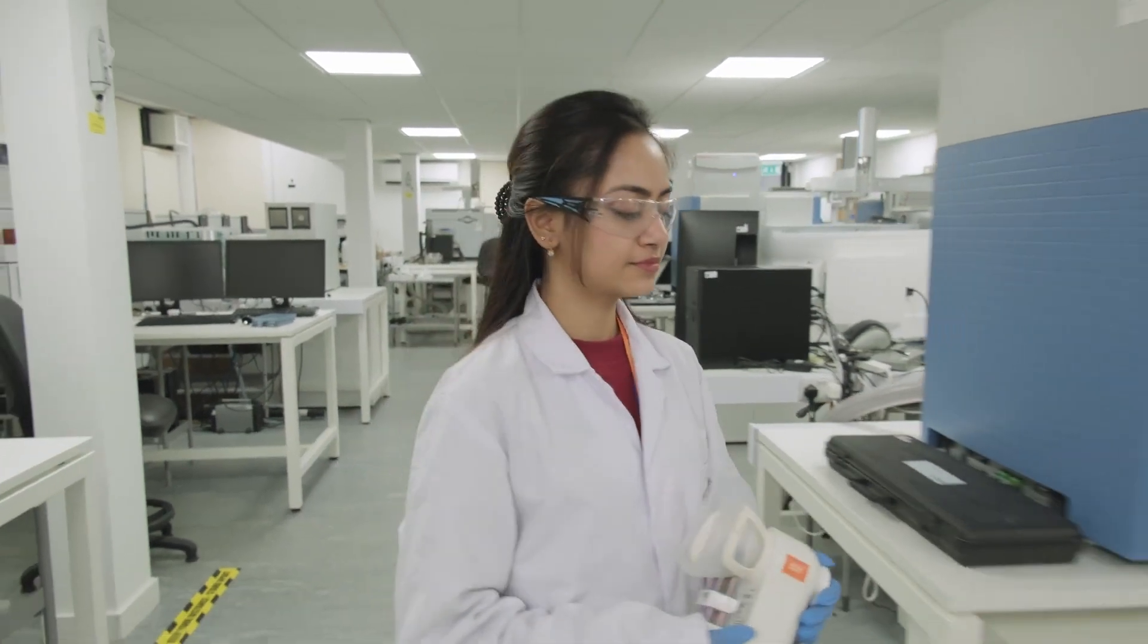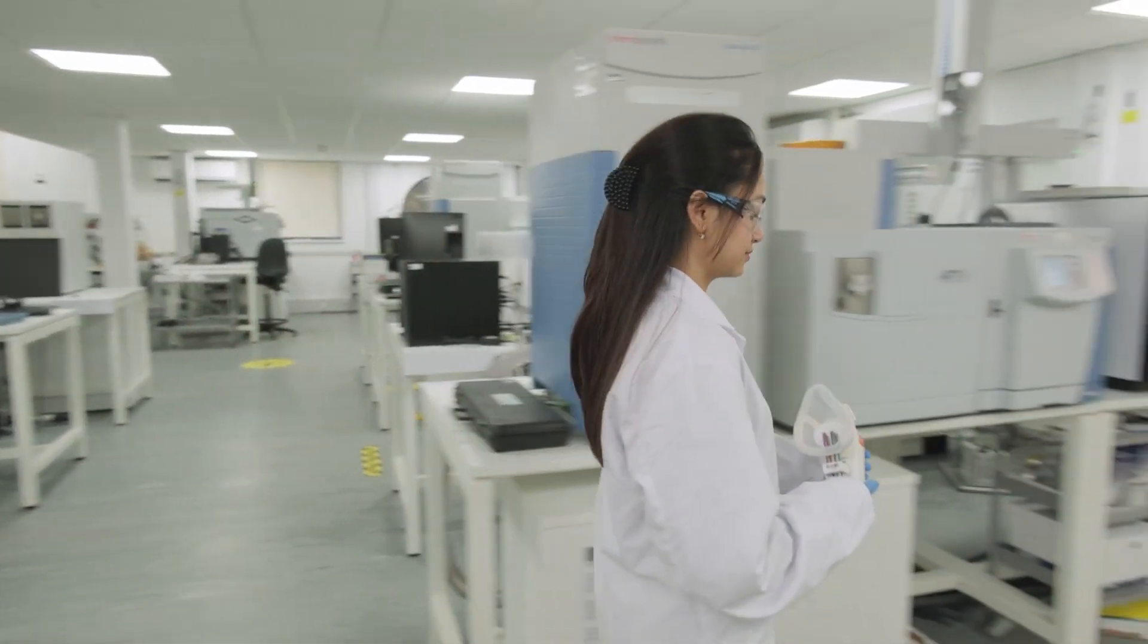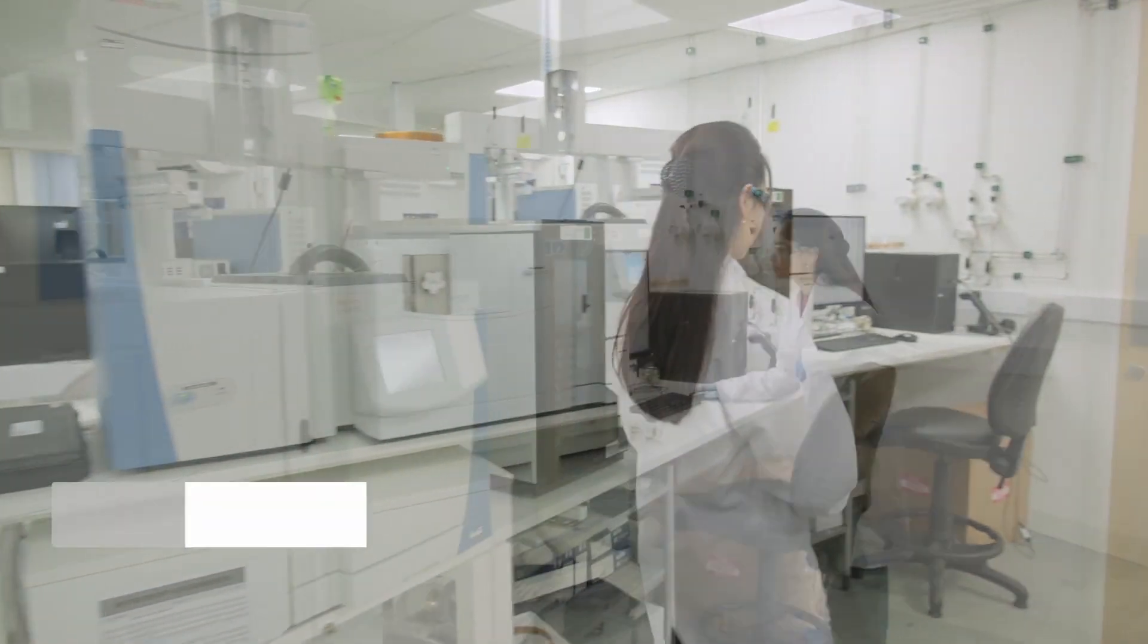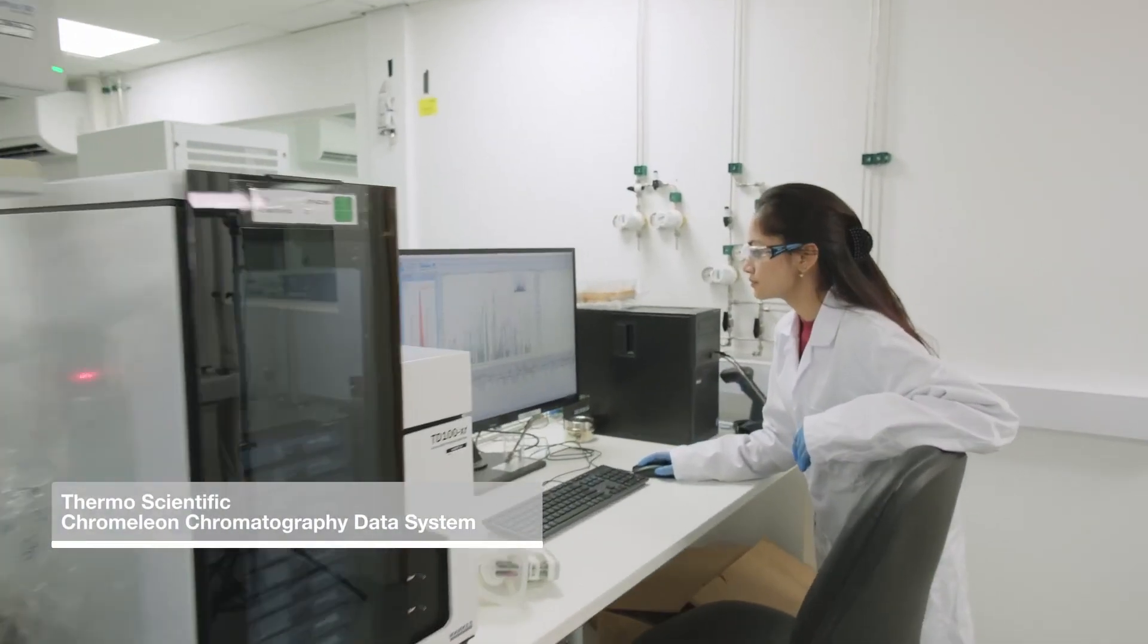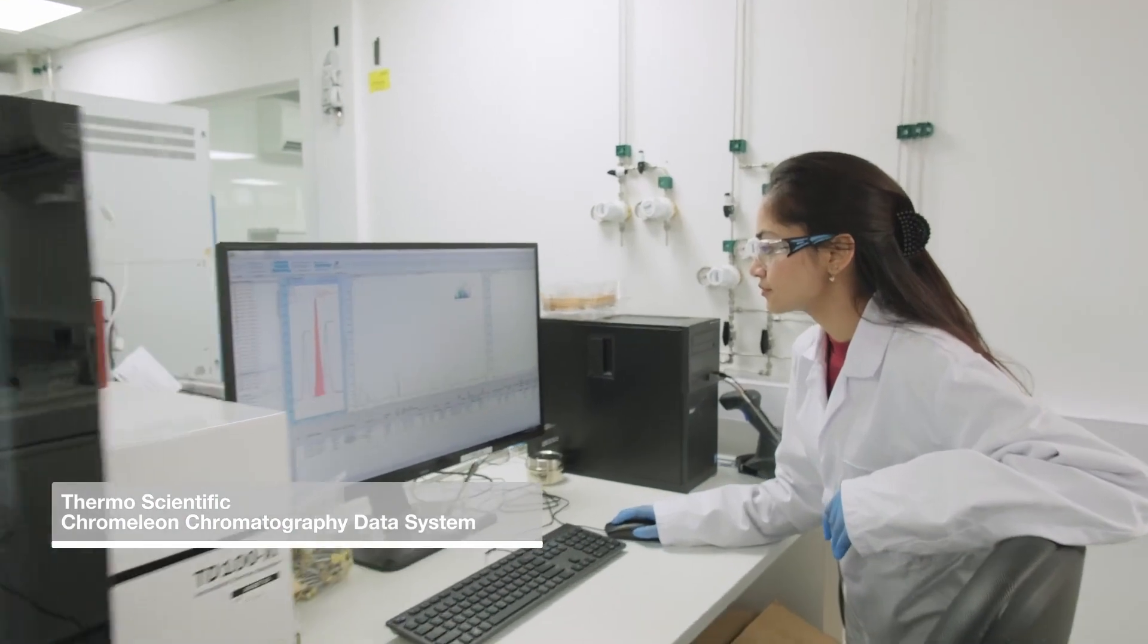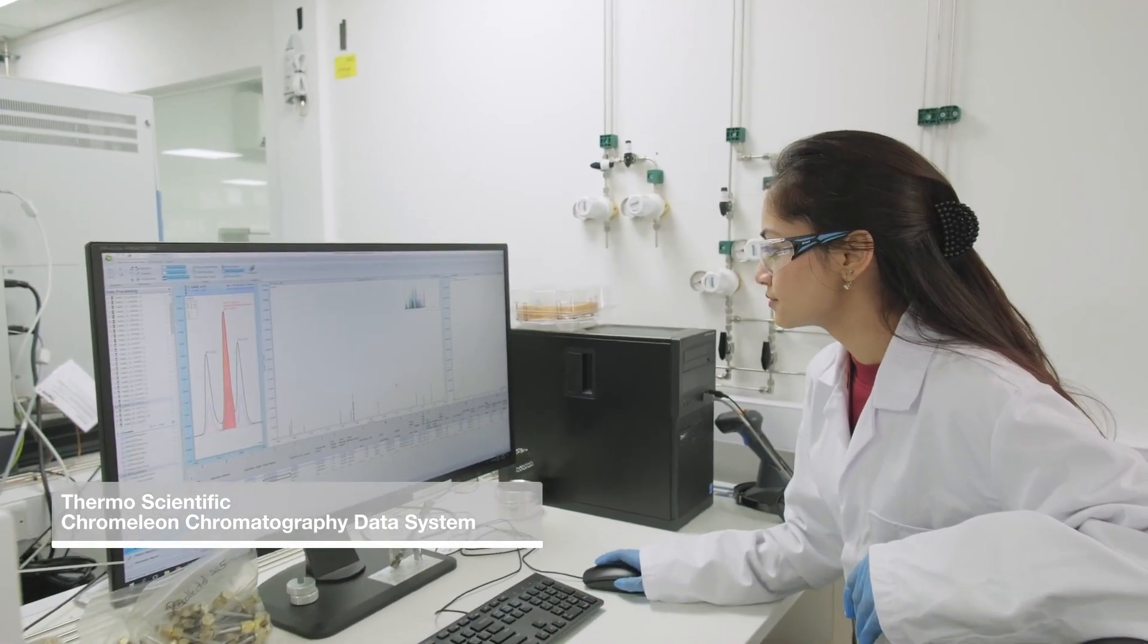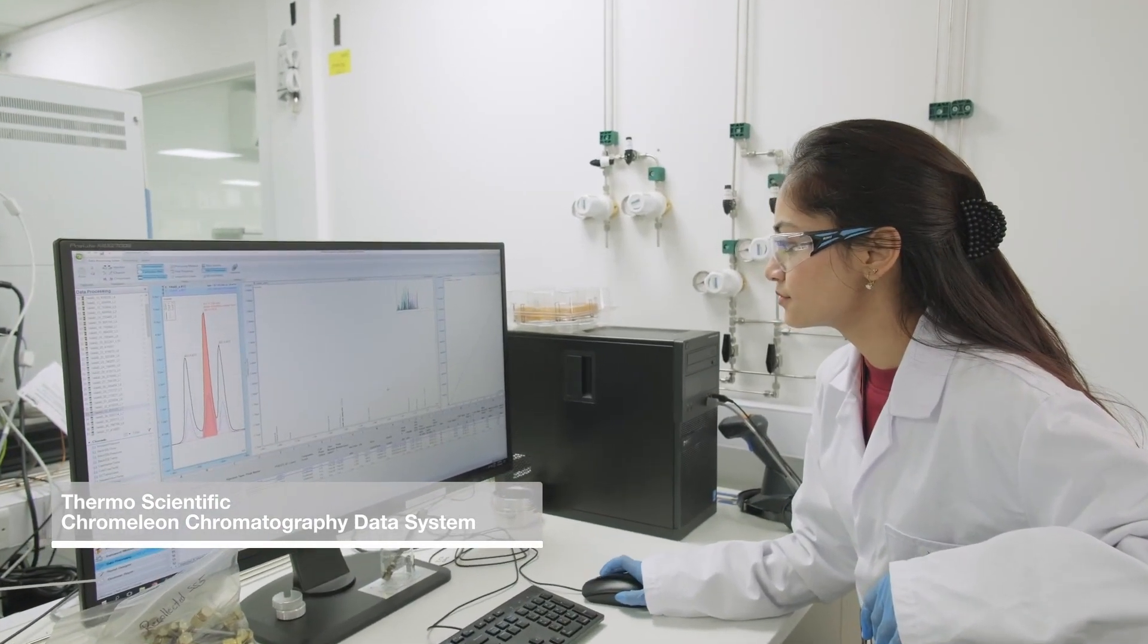The Thermo Scientific Orbitrap mass spectrometers, coupled with Thermo Scientific Chromeleon software, provide enhanced data acquisition, management, and processing, offering an end-to-end solution perfect for our high-throughput laboratory.